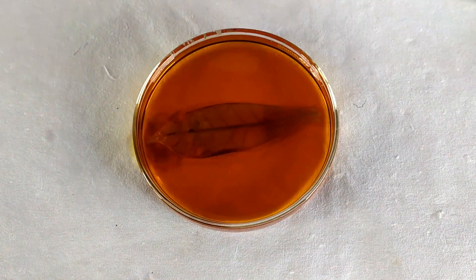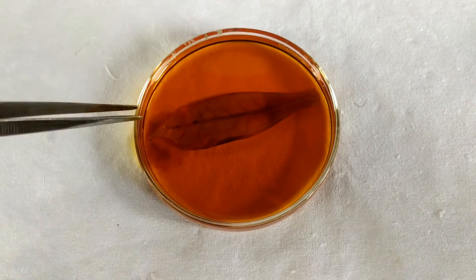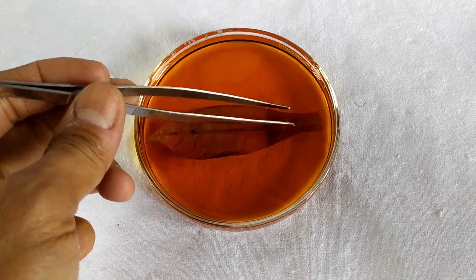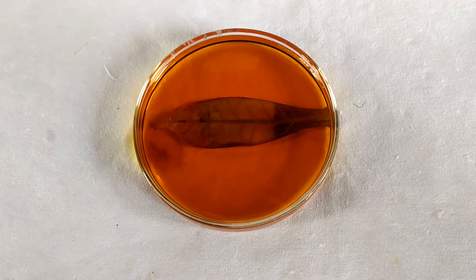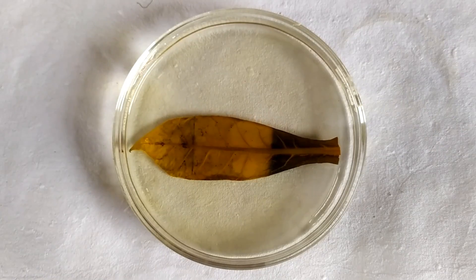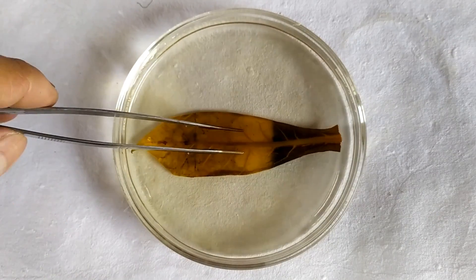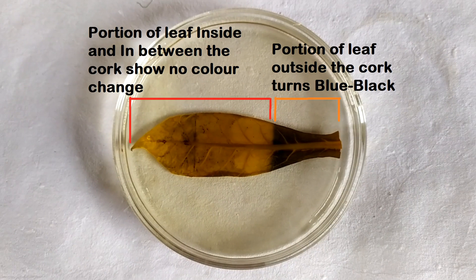Transfer the leaf into a petri dish containing iodine solution. After a couple of minutes, you will notice this result: the portion of the leaf outside the flask and the cork turns blue-black in color, while the portion of the leaf in between the cork and inside the flask does not show any significant change in color except for a faint brown iodine color. This is a negative test for starch and thereby photosynthesis.